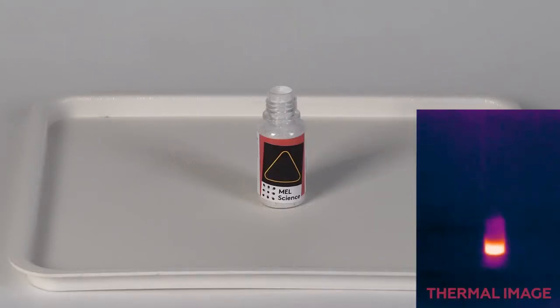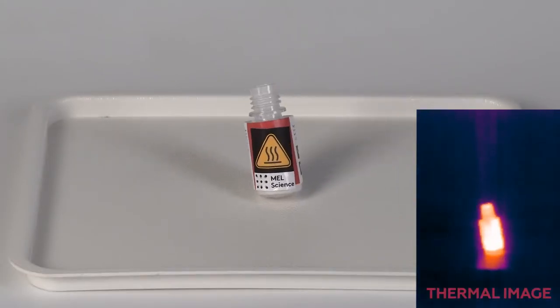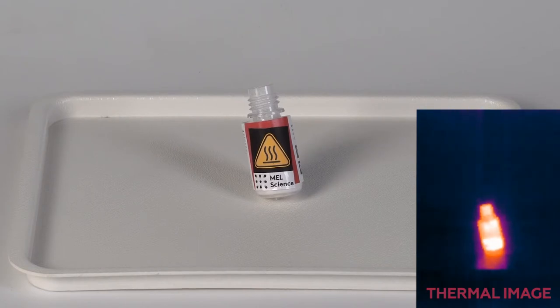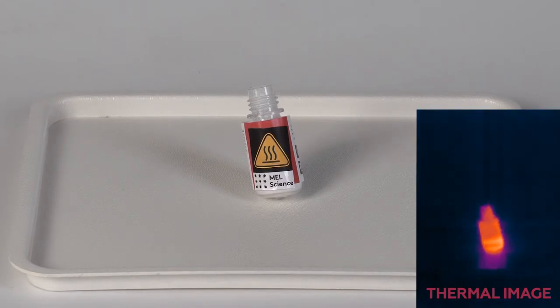Calcium oxide and water react to form calcium hydroxide. As a result of this reaction, a great amount of heat evolves. The temperature increases so much that the plastic bottle crumples and the thermosticker changes its color.